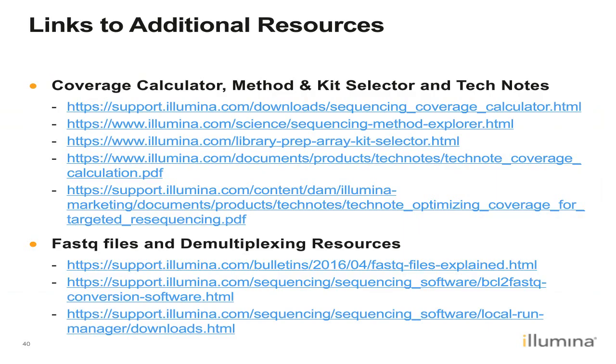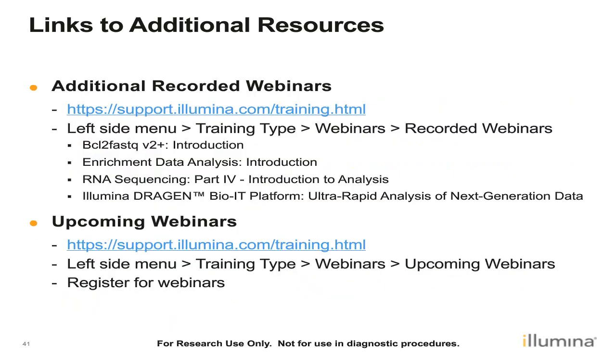These first set of resources are going to be geared towards your design, your planning and designing. So your coverage calculator, method and kit selector, and tech notes are available here. I do have resources on FASTQ files and demultiplexing. Of course, we won't be able to do any type of analysis if we don't have the correct FASTQ files or correctly demultiplex our samples. So I definitely have resources here. And then lastly, I have additional recorded webinars that you can check out as well.